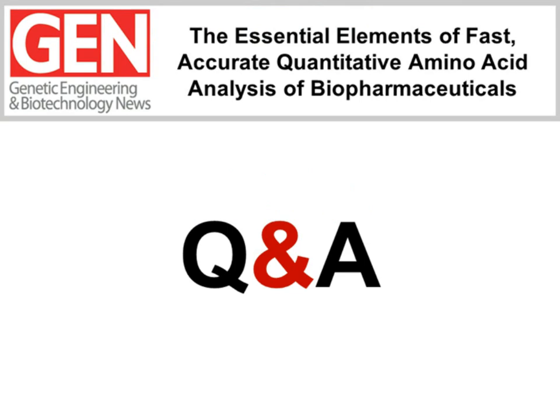Okay, Tom. Let's take this first question here. How do the results for this method compare to some of the other techniques for amino acid analysis?